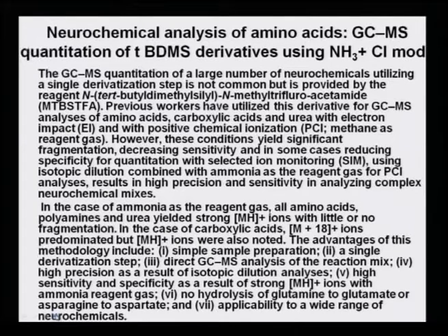However, these conditions yield significant fragmentation, decreasing sensitivity and in some cases reducing specificity for quantitation with selected ion monitoring, that is the SIM method. Using isotopic dilution combined with ammonia as the reagent gas for PCI analysis results in high precision and sensitivity in analyzing complex neurochemical mixes.